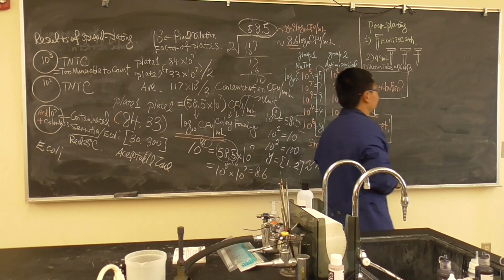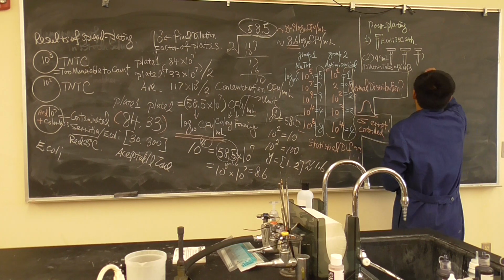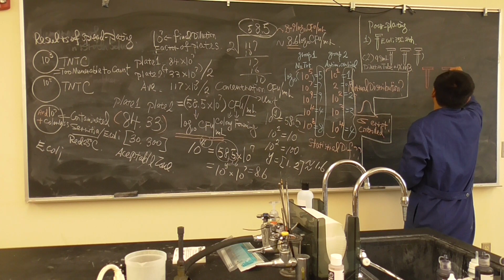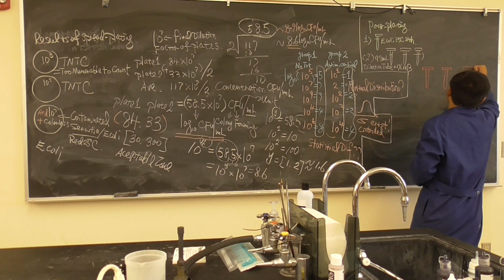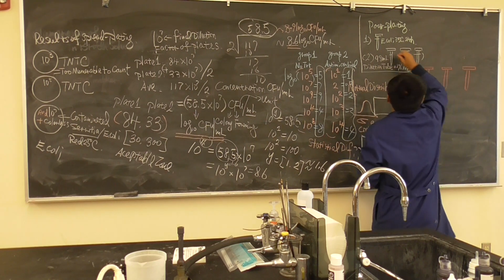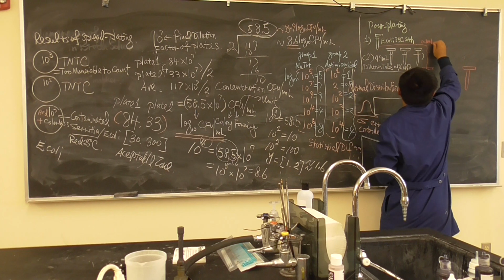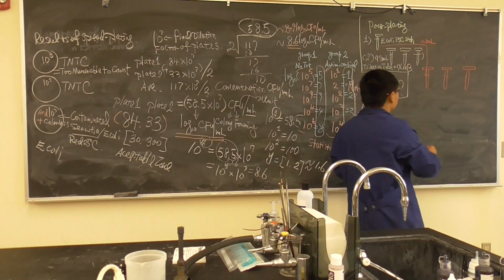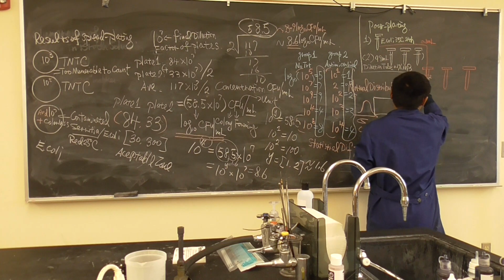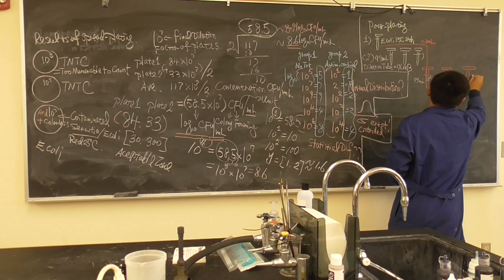Okay, how are we going to do it? I'm going to draw separately right here. This I'm not going to show you again because you know how to do it. Label these dilution tubes because we are still going to add 0.1 ml from the original tube into the first one. So this will be labeled tube dilution 10 to the 2 because this is 9.9 ml. This is tube dilution 10 to the 4 and that one is 10 to the 6.